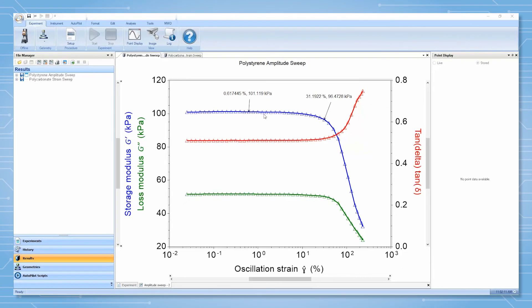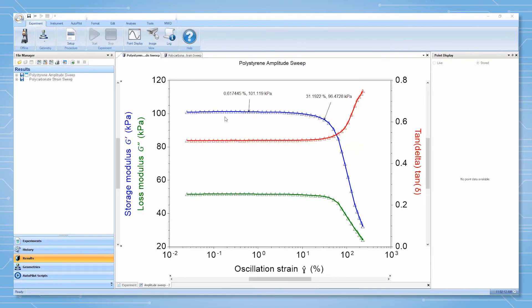The strain or amplitude should be selected at a point in the plateau where the data is not noisy and the point display shows smooth and sinusoidal curves.